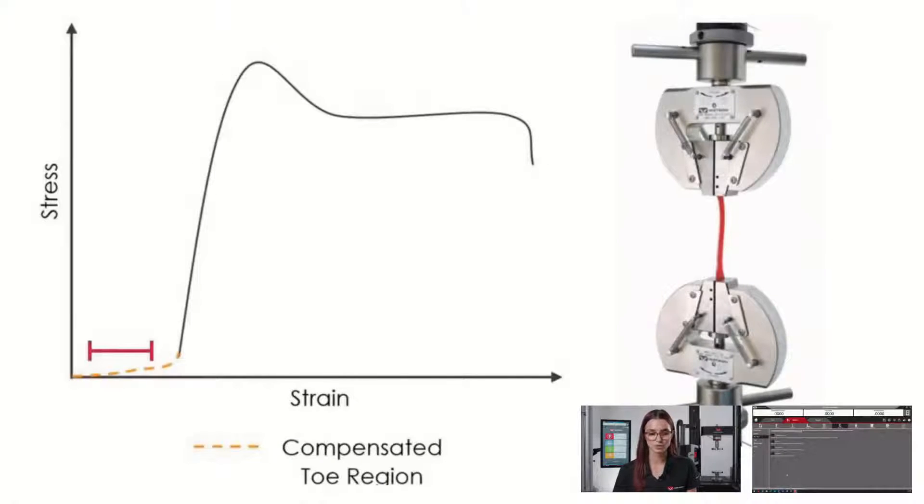Preload and slack correction are a method to remove the slack of your specimens. As shown in this graph, this is a typical curve you would see where the slack has not been removed. At the beginning of the curve, you see a region in which the force does not increase. Once the specimen then becomes taut, the load will then increase.